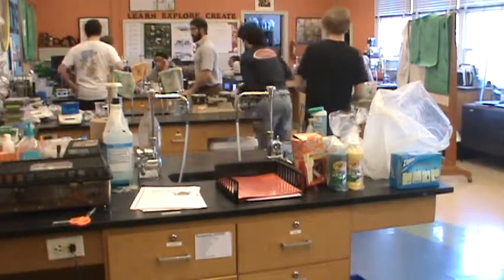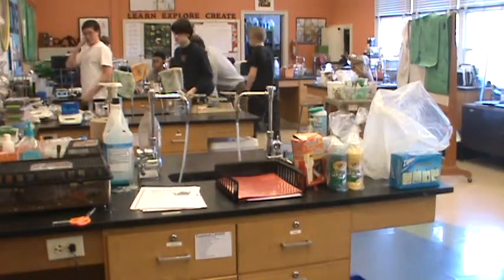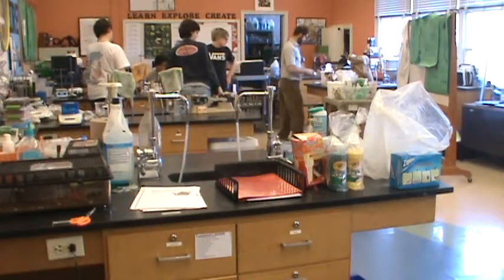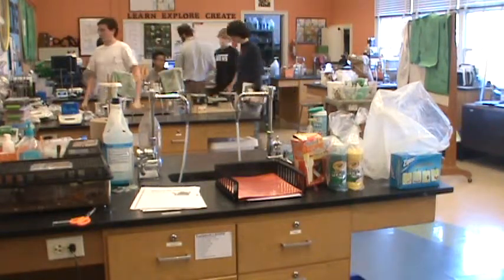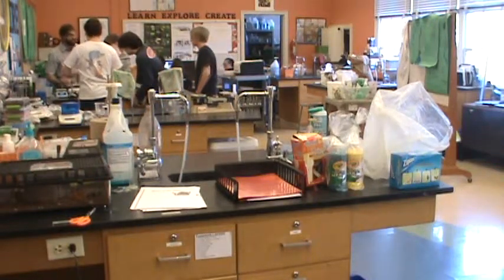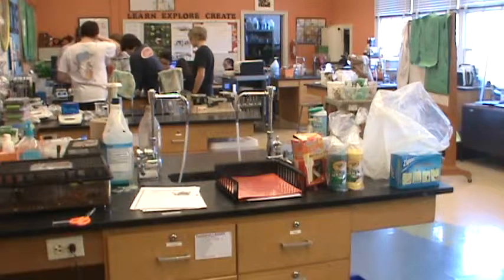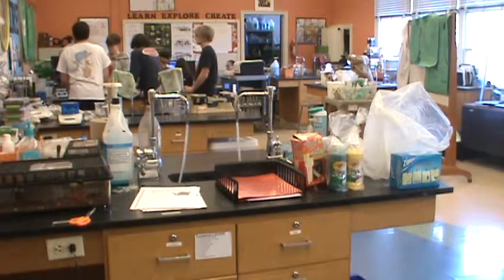Alright, so we have the digital scale over here and the digital scale over here. Then you want to move back over there. Set out what you want. This is the one that I would use. Exactly right. We also use your balance. Check.